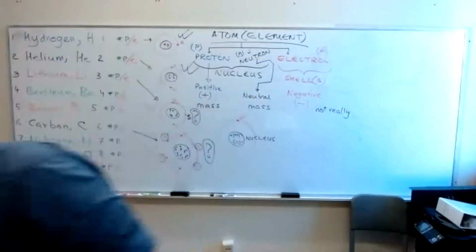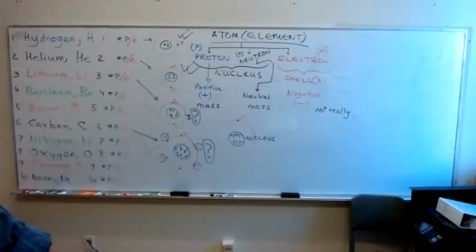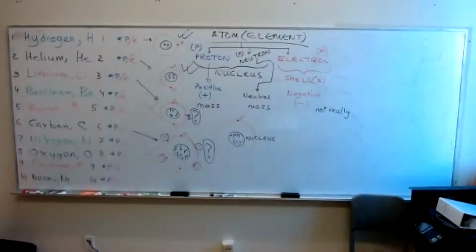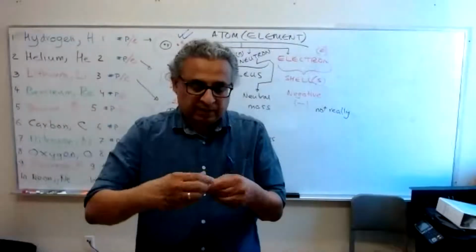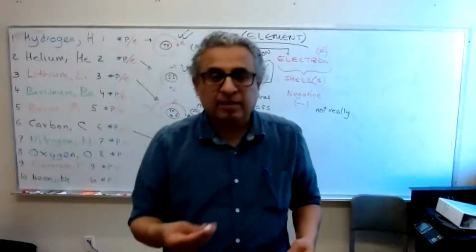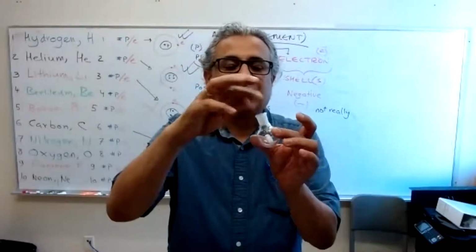Something cool you must know, that we have to sometimes use, a little device. Where is that? Where is my... there you go. Where is my stir bar? I cannot pronounce stir bar. I've been mocked before. I wish there were some bonus points for this.